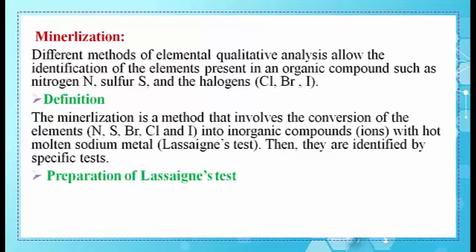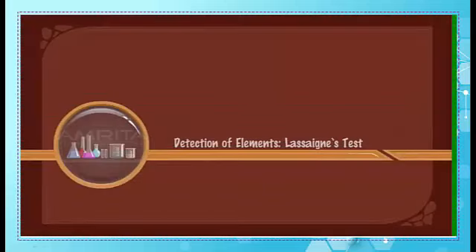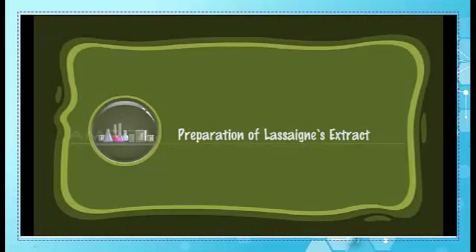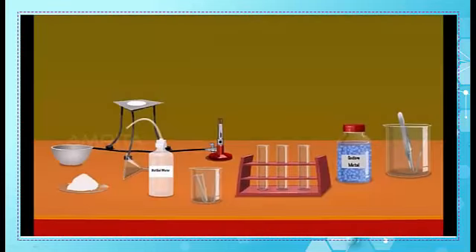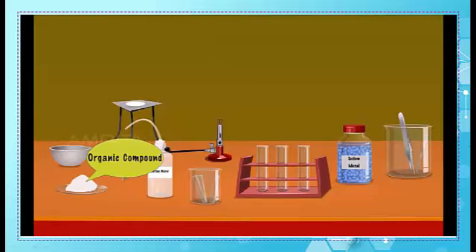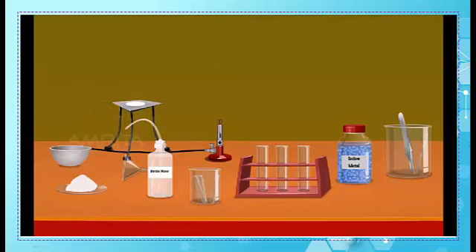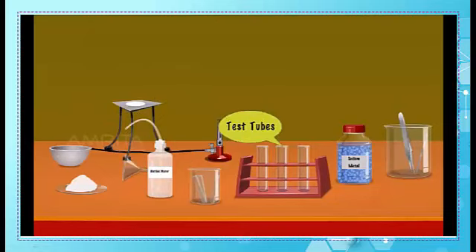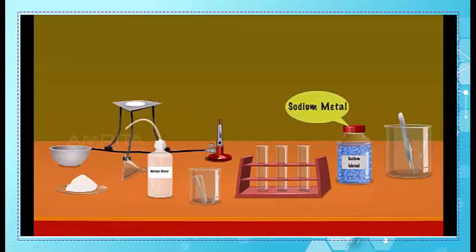How to prepare Lassaigne's extract — let's watch this video. Detection of elements: Lassaigne's test. Preparation of Lassaigne's extract. We require a China dish, organic compound, funnel, tripod stand, wire gauze, distilled water, Bunsen burner, fusion tubes, test tube, sodium metal, small spatula, and forceps.